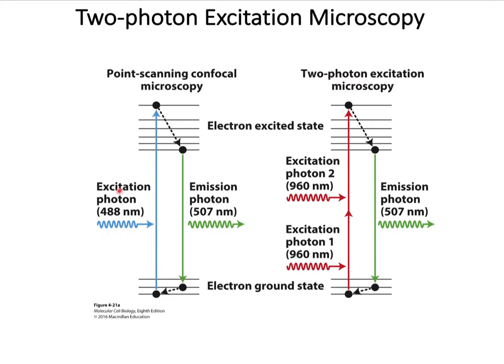This issue is resolved by the two-photon excitation microscopy. In two-photon excitation microscopy, near infrared wavelengths are used, which have much less energy. Remember that the shorter the wavelength, the higher the energy; the longer the wavelength, the less the energy. Just think that UV in the sunlight, of shorter wavelengths, less than 300 nanometer, can cause sunburn, but say blue light, as in the above example of 488 nanometer, will not cause a skin burn.